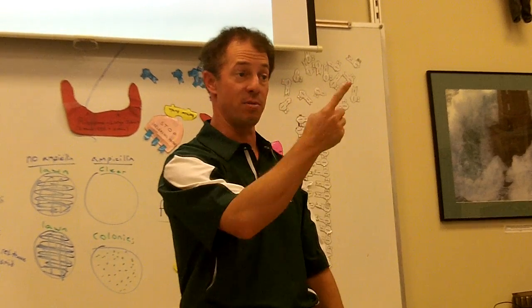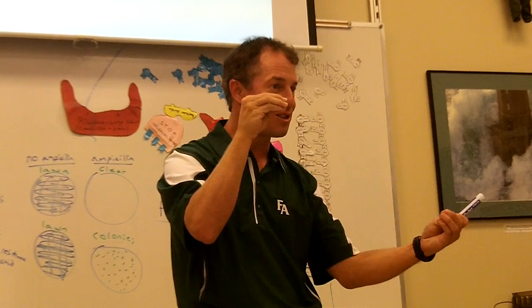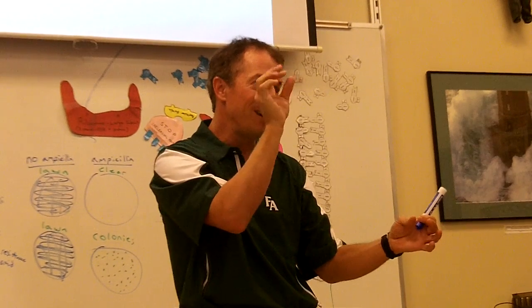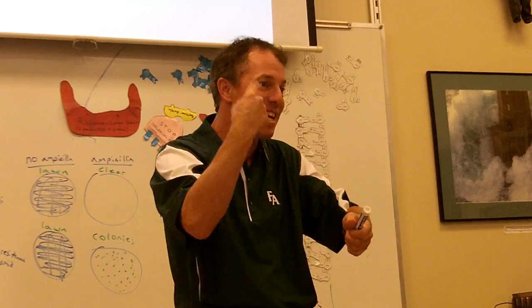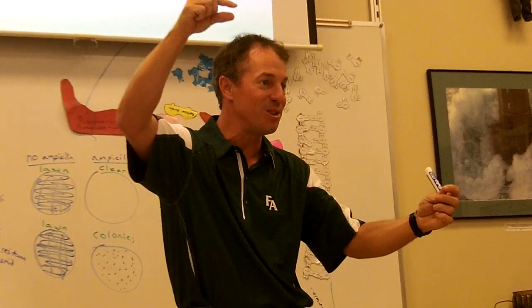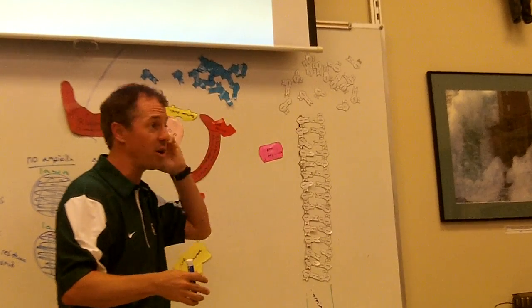There's a machine called a centrifuge that spins things around. The heavier stuff goes to the bottom of the tube, and the lighter stuff stays on top. For every little organelle in a cell, they know how fast they have to spin it and where it will settle in this long tube. You see what I'm saying? Yeah. So now I have a centrifuge. I'll show you how it works.